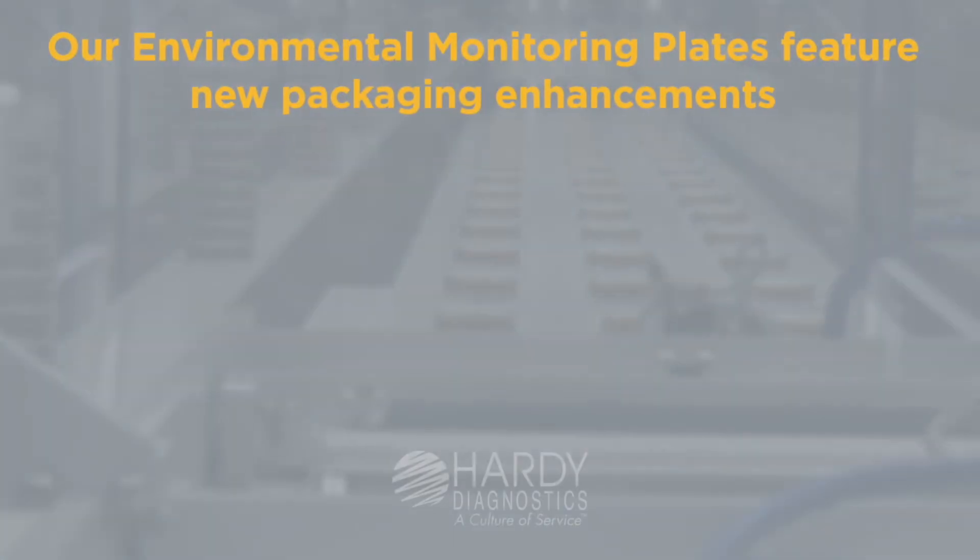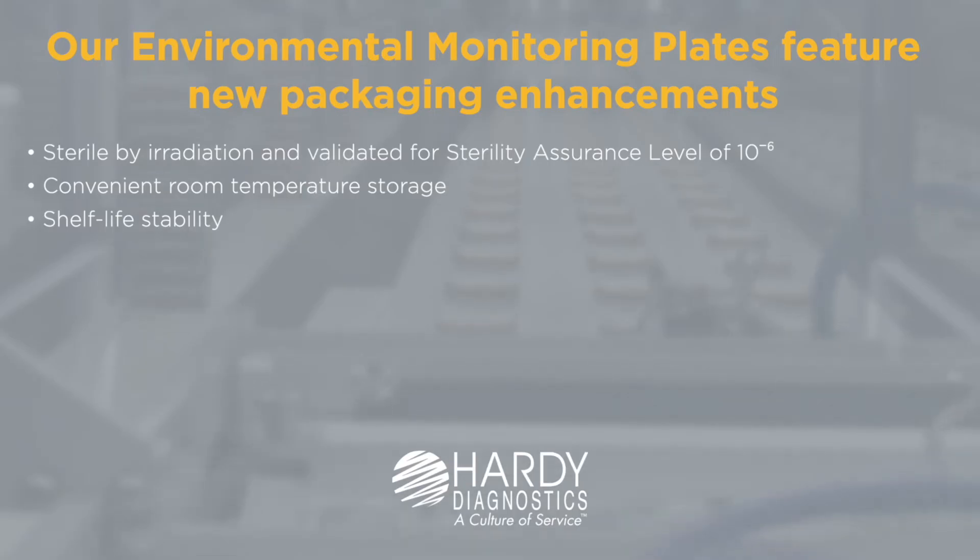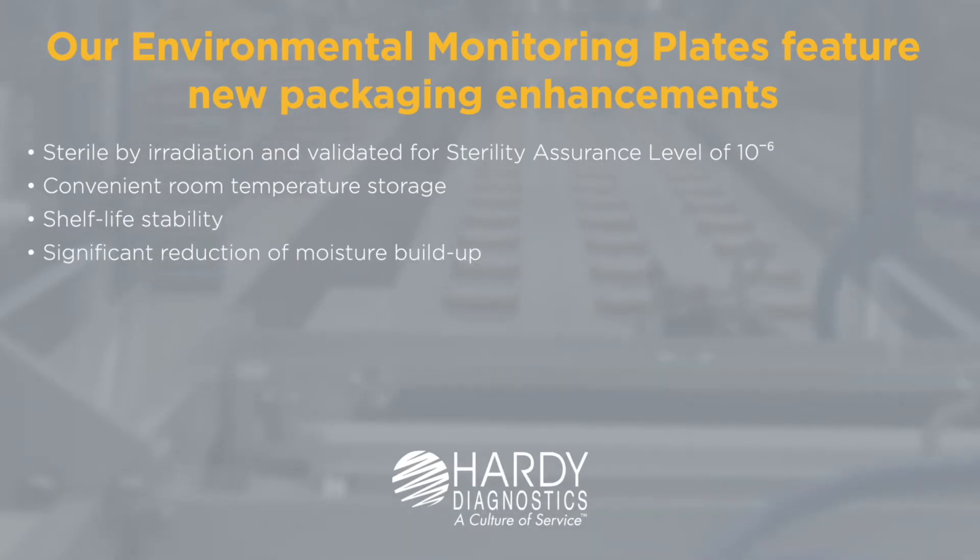Our environmental monitoring plates feature new packaging enhancements. Sterile by irradiation and validated for a sterility assurance level of 10 to the minus 6. Convenient room temperature storage. Shelf life stability. Significant reduction of moisture buildup.